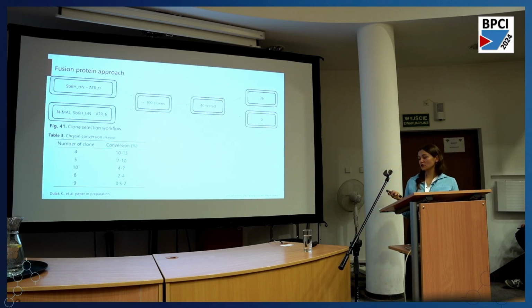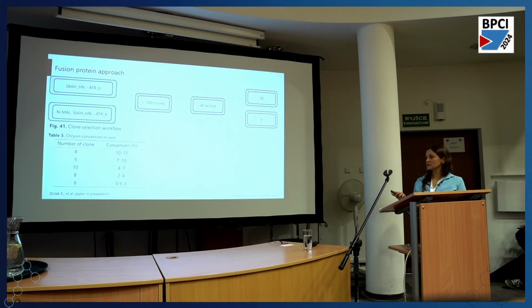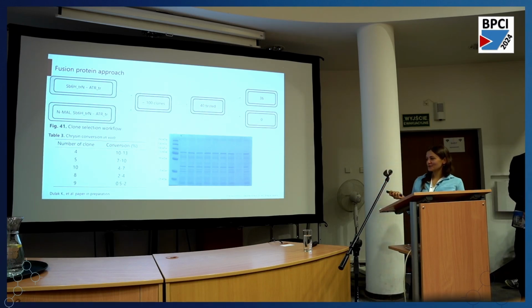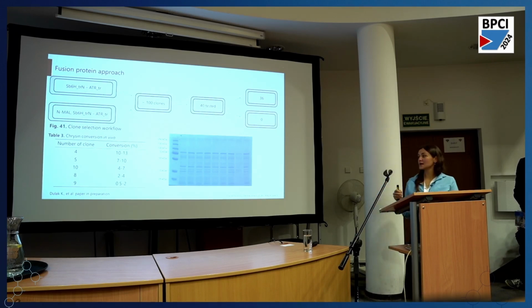For the 9 clones with the best substrate conversion, we also decided to run SDS-PAGE analysis, and the expected size for the protein is supposed to be around 130 kilodaltons, but as you can see, we were still able to detect the separate proteins. So that's also something we need to verify at this moment.